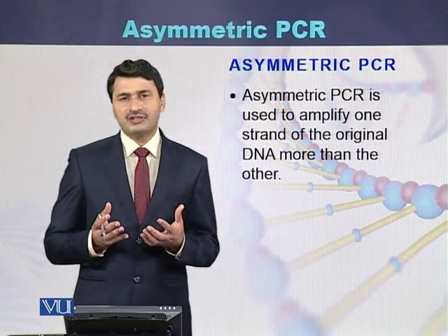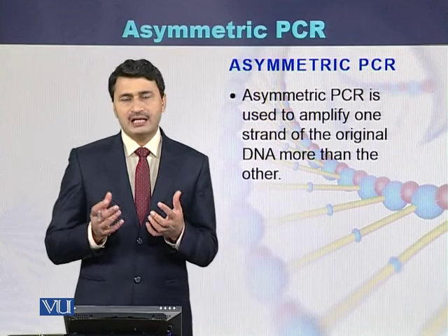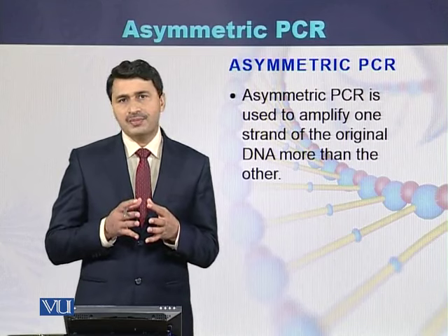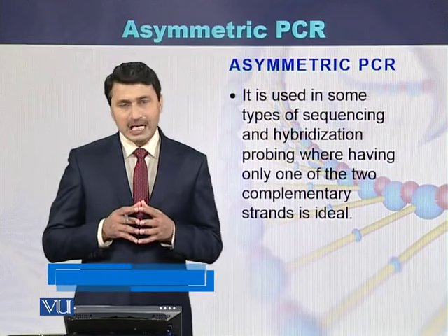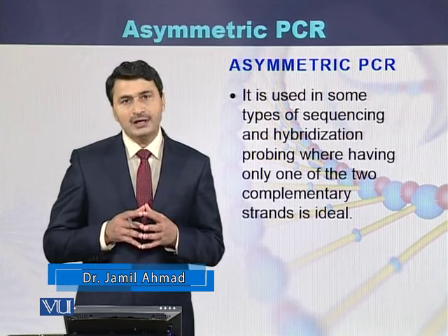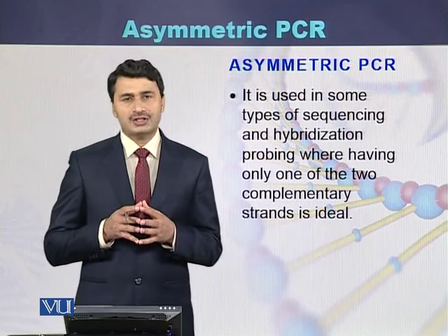In this type of PCR, because the DNA is double-stranded, one strand is more amplified as compared to the other strand. It is used in some types of sequencing and hybridization probing where having only one of the two strands is needed in more quantity.